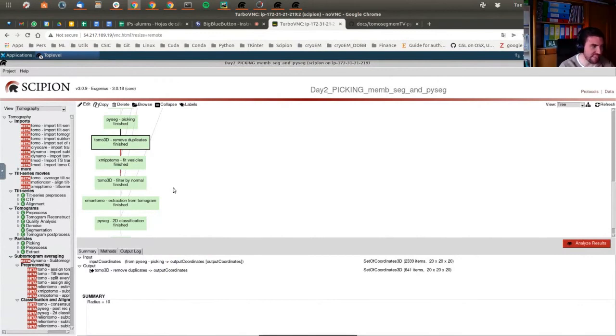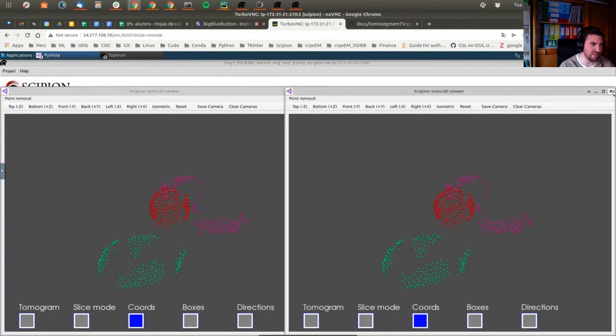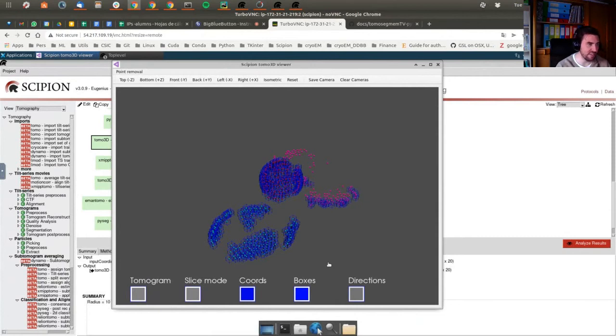Indeed, it was loading, but the machine is going very, very slow. This is a representation. You can paint the boxes. I shouldn't click there because it's not used for this kind of problem.